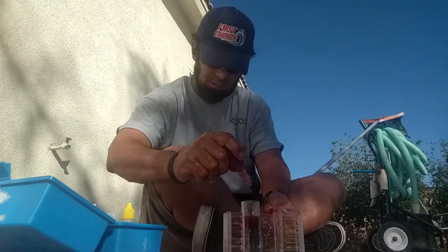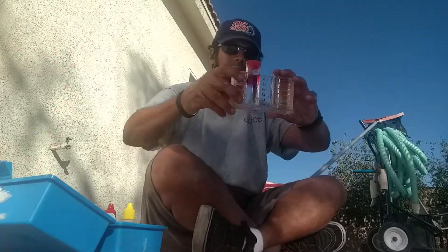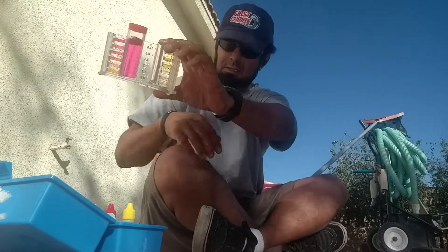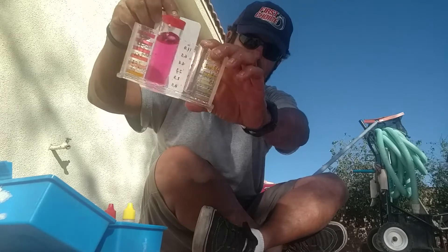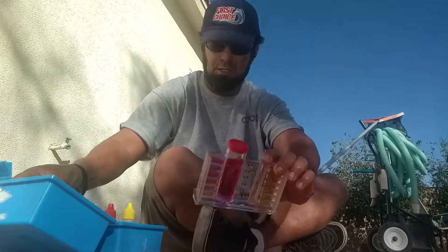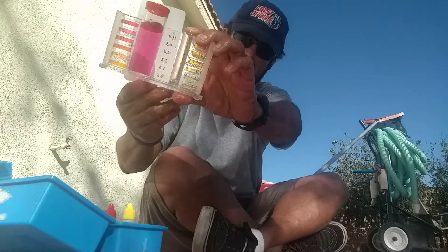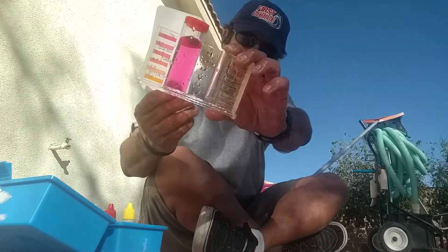One, two, three, four, five drops. Go ahead and shake it up. You can see it's a little bit on the dark side — it's darker. I try to go for a pink, but that's more of a purple. On the lower end of the scale here, around 7.2 to 7.4.